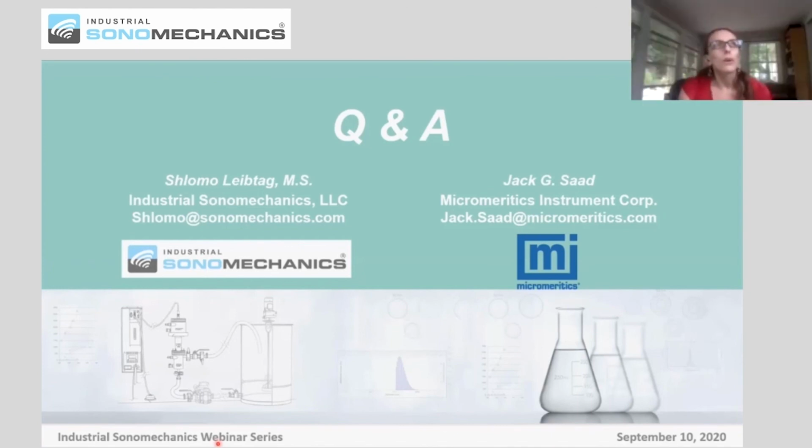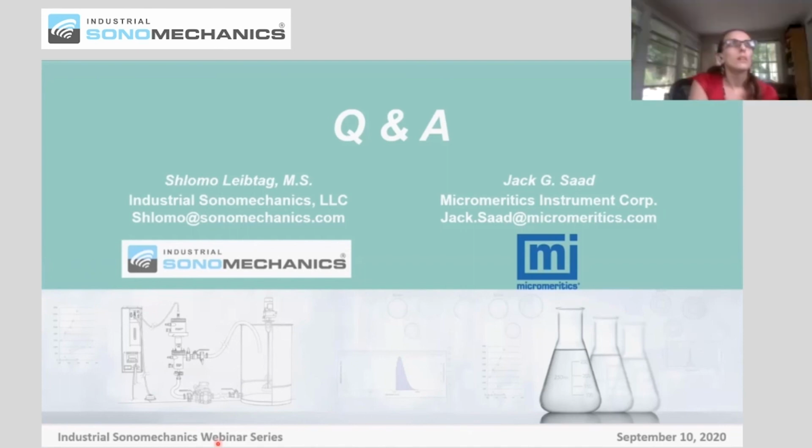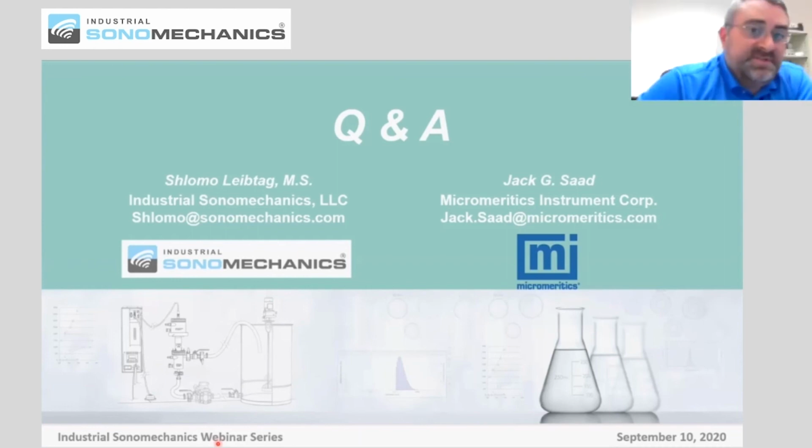Thank you, Shlomo. I have another question for Jack. What is the relationship between electrostatic repulsion, charge separation as measured by zeta potential, and steric repulsion? Specifically, does the bonding of polymeric surfactants required for steric repulsion affect zeta potential? Is steric repulsion what you're talking about? Steric repulsion. Yeah.